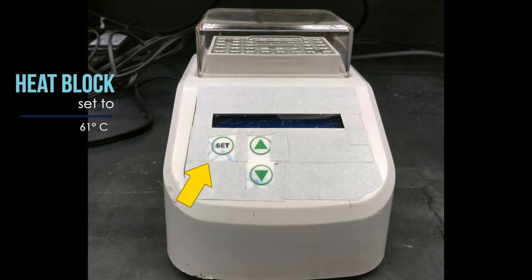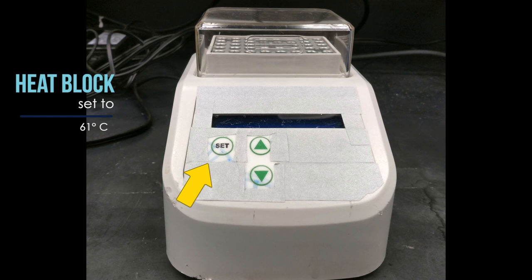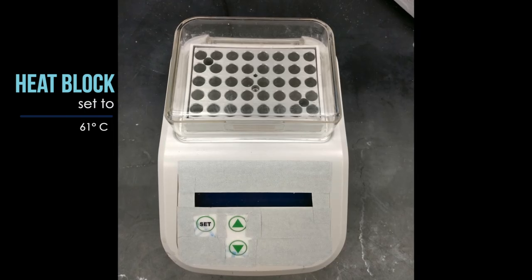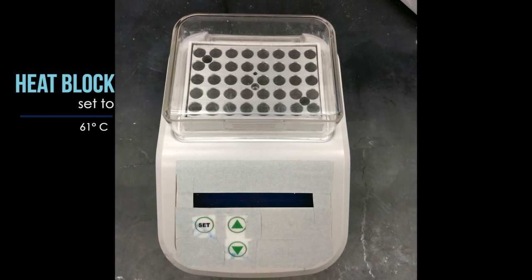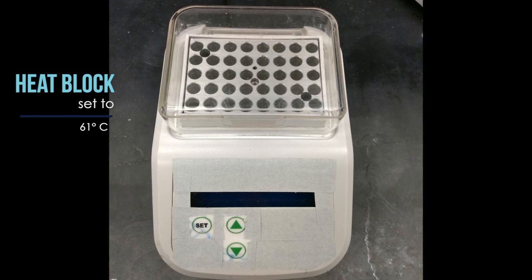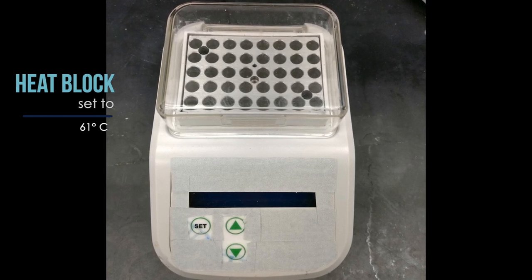We don't want to change the first digit, so we'll hit the set button again to edit the second digit and use the arrows to change the value. We hit the set button to move to the third digit and use the arrow to change the value. Once we get the temperature we want, we leave it alone and go mix our reagents.